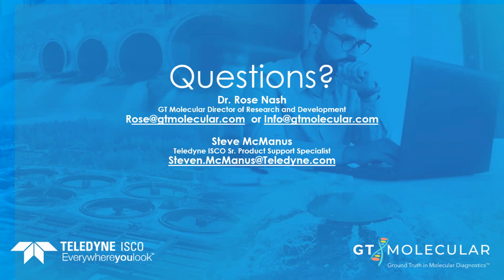The first question that is in the list here relates to what are the advantages of time versus flow-paced sampling. One of the application conditions that one could be faced with was a high variability in the amount of flow that can occur from time to time. So if one is simply taking time-paced samples and we're at a very minimum amount of flow, and the sampler attempts to collect the sample, it may not be able to, because there may not be sufficient amount of flow in the source to draw the sample in.